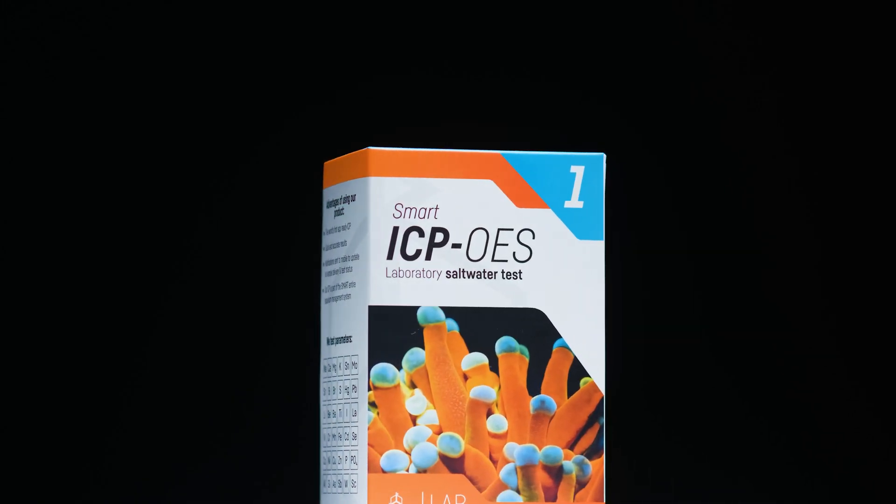A team of experts behind the method and test results, a dedicated ICP panel in a mobile app which is an integral part of the Smart Reef 360 method, Reef Factory ecosystem for comprehensive aquarium management, and synchronization of the parameters and the dosing panel within the Smart Reef app.